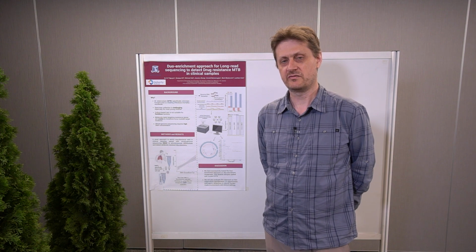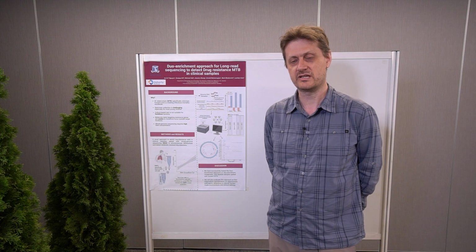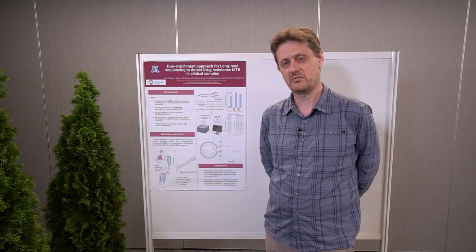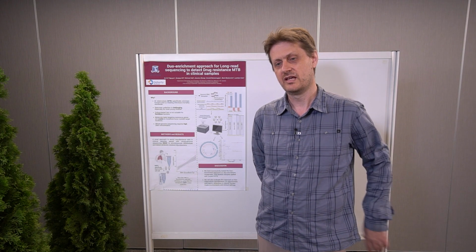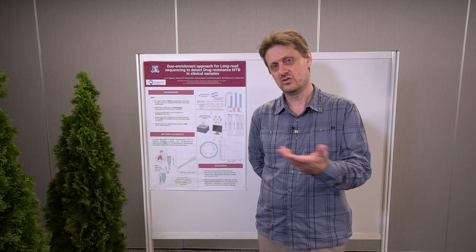Mycobacterium tuberculosis is a very slow-growing bacteria, meaning that to get enough DNA to perform whole genome sequencing, the bacteria needs to be cultured for at least 2 weeks and typically longer. And that's a problem because of the high rates of drug resistance in Mycobacterium tuberculosis. It's necessary to grow the bacteria in order to predict the drug resistance, and that's necessary to make sure that the patients are getting the correct treatment early on. Given the long time it takes to get that amount of DNA, that delays use of appropriate treatment.